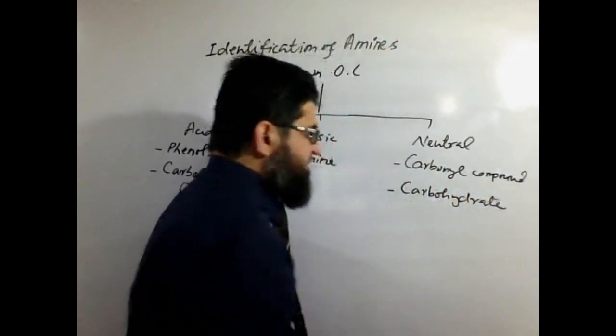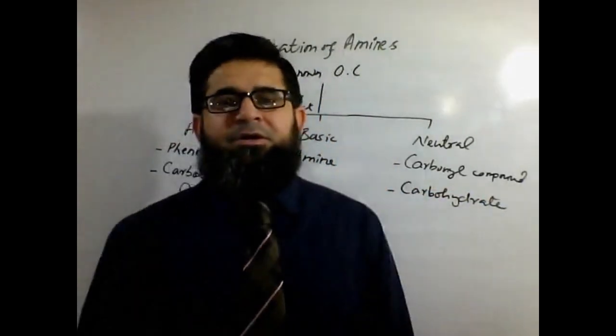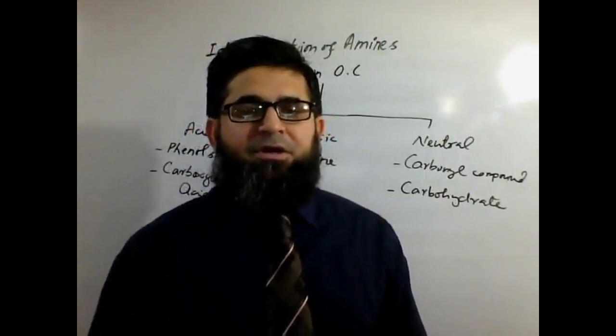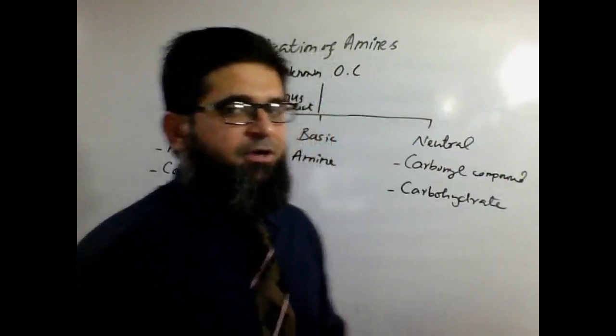So this is the starting point about the identification of unknown compounds in the laboratory using different confirmatory tests.